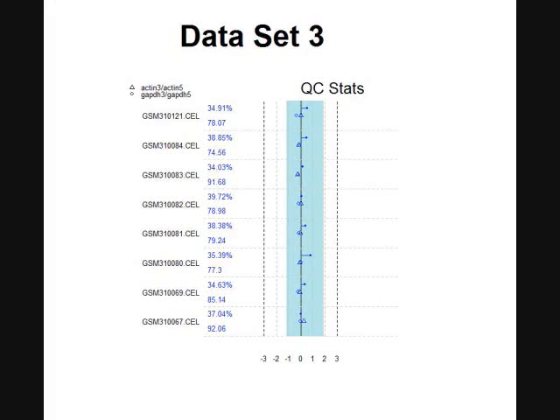And so this is a standard QC plot that you would plot out really before you began anything else, just to make sure that you don't have any crazy outliers in the data. You see here all the cell files listed and everything is in blue.